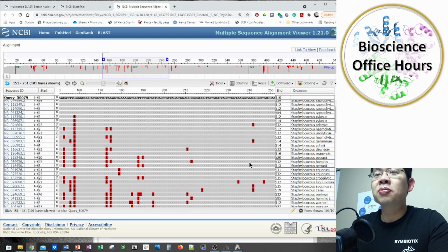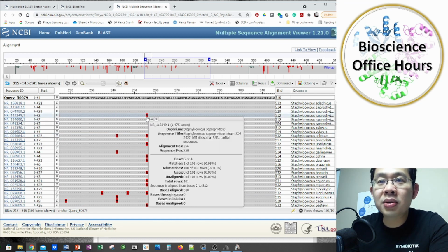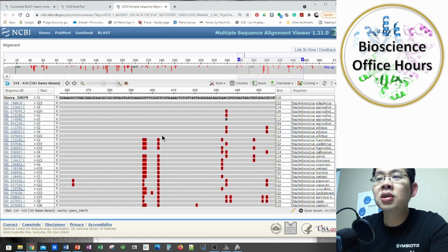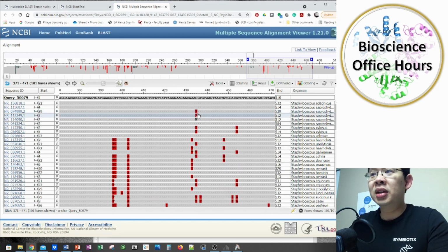If you look at Staphylococcus saprophyticus and the others all the way to the end, in saprophyticus there's one that has a change over there, but most of them have none. Oh, there's one here, T. There's one sequence different, the T over here for one of the saprophyticus. So this is another example right here.